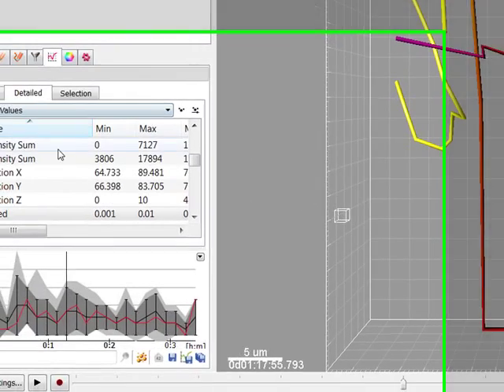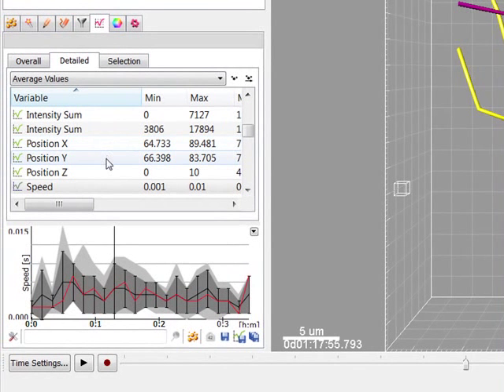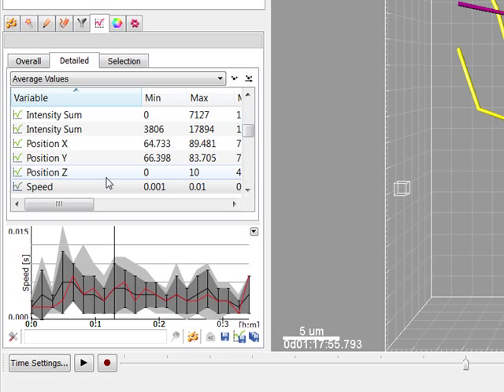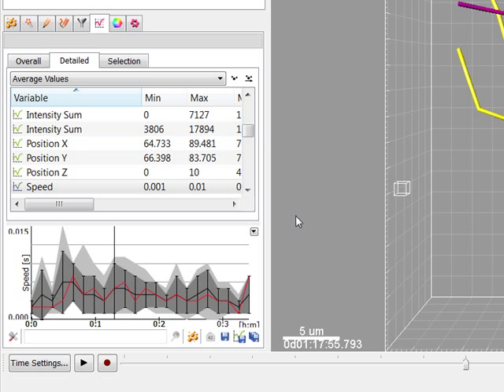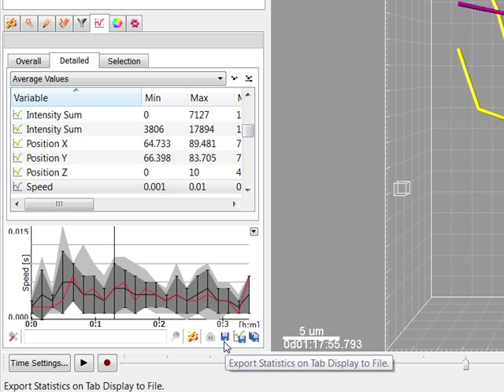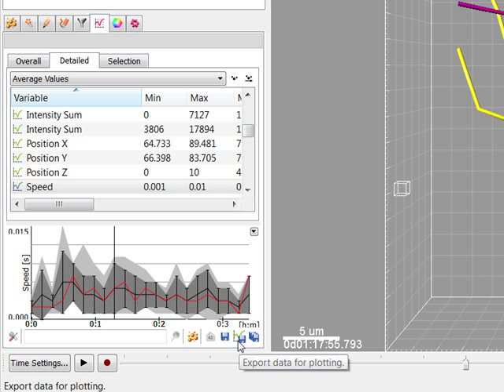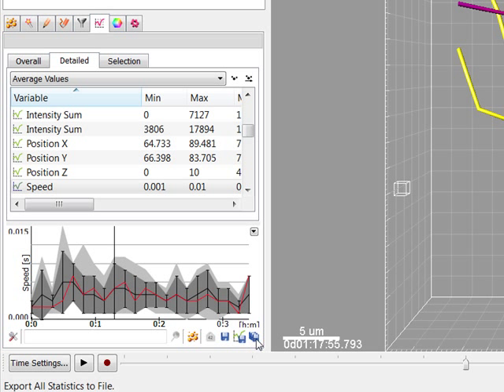For some further statistical analysis, you can export the data either as a comma separated values file or directly as an Excel file. You can choose to export only the values that are shown within the current tab, or time-dependent data, or all statistical values.